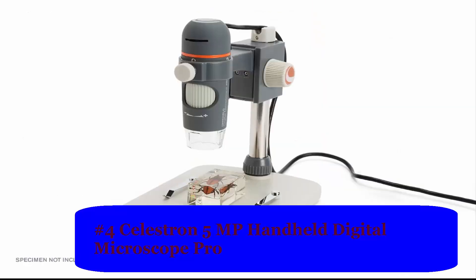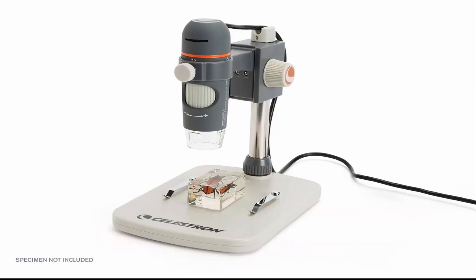Number 4: Celestron 5MP Handheld Digital Microscope Pro. True 5MP sensor to capture and save higher resolution images and videos of your specimens. 5-element IR cut high quality glass lens ensures sharper images. Shutter speed 1 second to 1/1000th second. 20x to 200x magnification powers — great for low power observation of 3D specimens. Note: final magnification determined by monitor size. Includes a 4-foot USB 2.0 cable for easy maneuverability when viewing large surfaces.